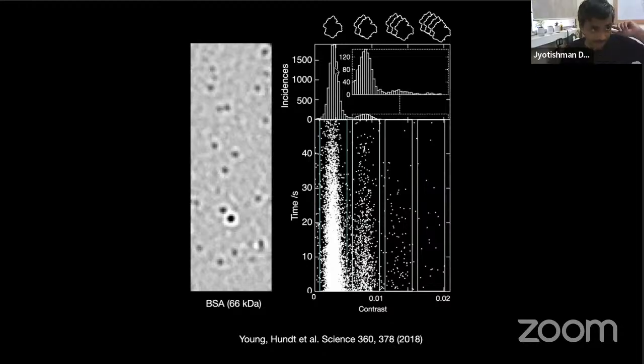You know, for instance, there's another universe where this imprecision can also be helpful. A lot of proteins are glycosylated, for example, and they're not all glycosylated in the same way. So you actually end up with quite a heterogeneous mixture. You try and put a glycosylated protein into a mass spec, it's not a happy place. So one opportunity. But for us, it doesn't matter because we can't resolve. Absolutely. But we still go, oh, it's about 60 kilodalton.